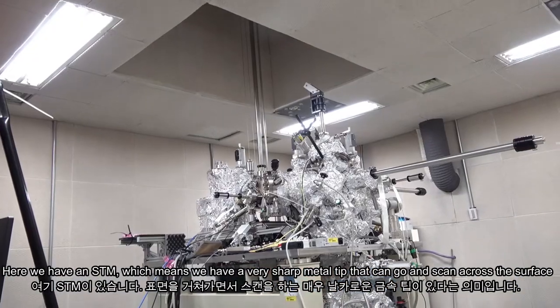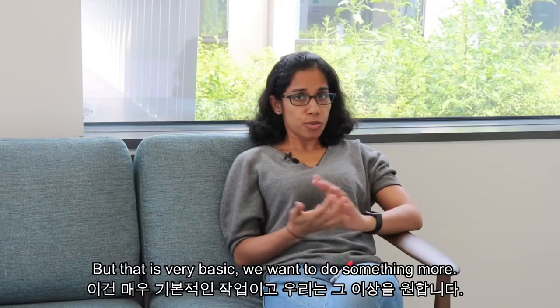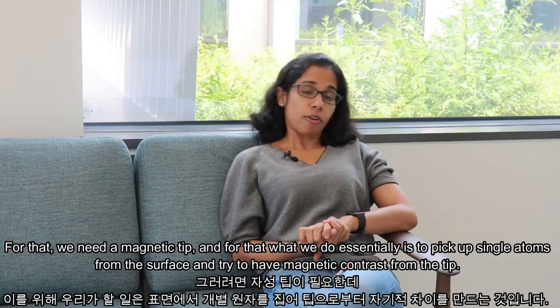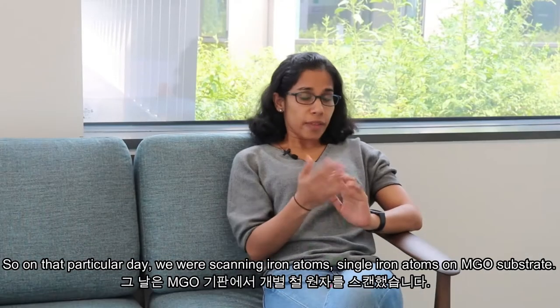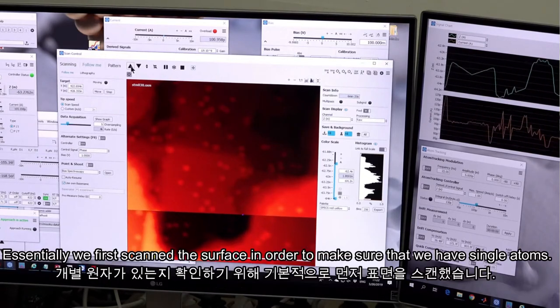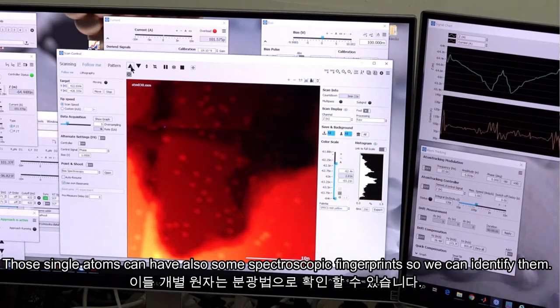We have an STM, which means we have a very sharp metal tip that scans across the surface — that's the basic way to image single atoms and molecules. But we want to do more: we want to do magnetic characterization, and for that we need a magnetic tip. On that particular day we were scanning single iron atoms on an MgO substrate. We first scan the surface to confirm we have single atoms, which can also have spectroscopic fingerprints so we can identify them.